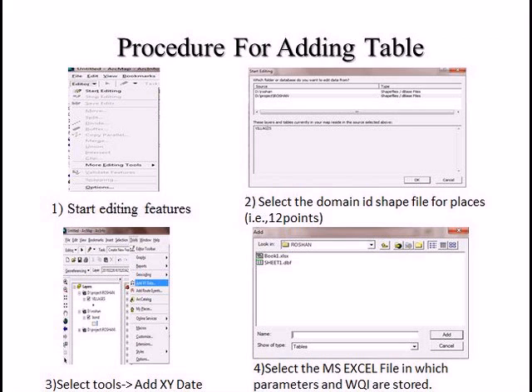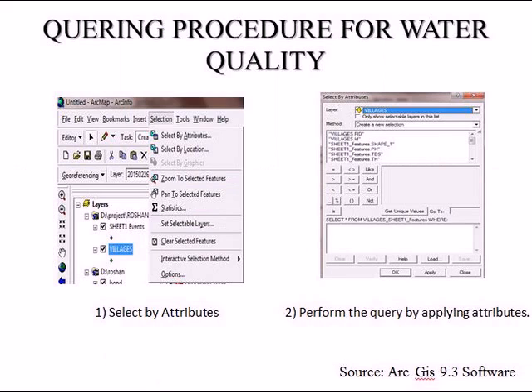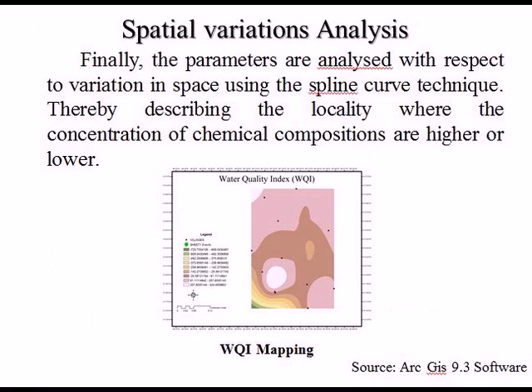Chemical parameters were collected and examined. For examining the quality of water, the important parameters are pH, TDS, TH, calcium, magnesium, total alkalinity, sulfate, fluoride, etc. These were the IS standard codes where the acceptable range and the permissible range of the parameters were explained.